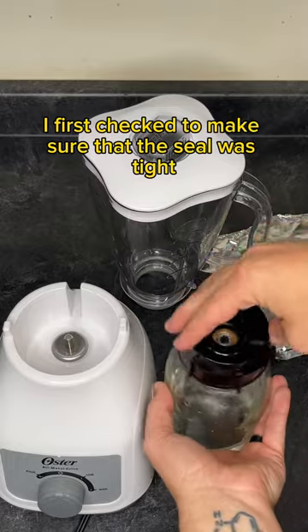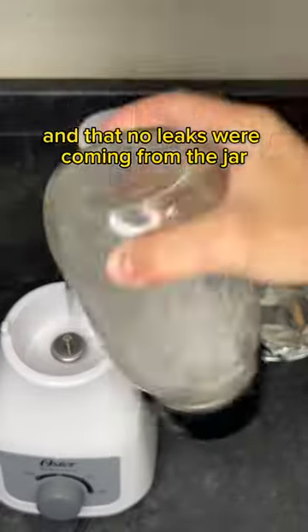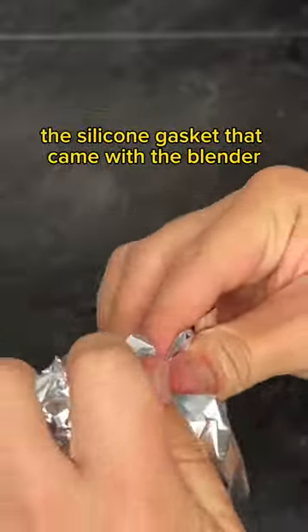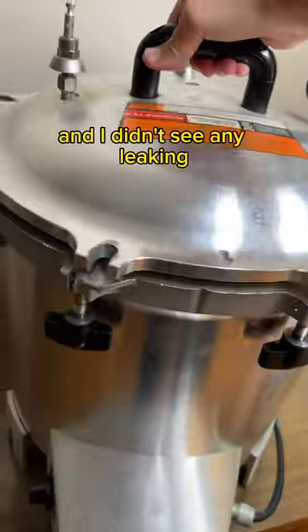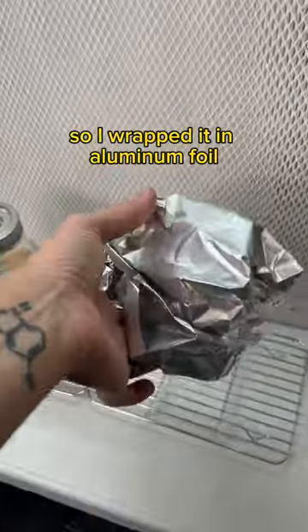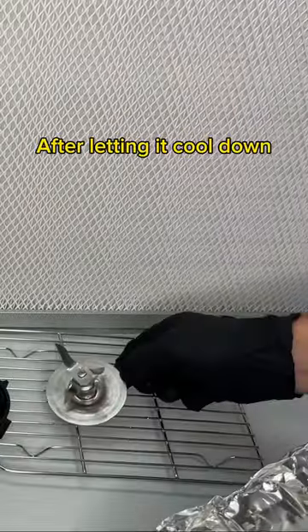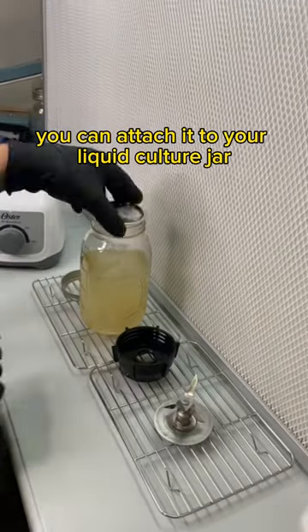I first checked to make sure that the seal was tight and that no leaks were coming from the jar without using the silicone gasket that came with the blender. Everything looked good and I didn't see any leaking, so I wrapped it in aluminum foil and pressure cooked it at 15 psi for 20 minutes. After letting it cool down you can attach it to your liquid culture jar.